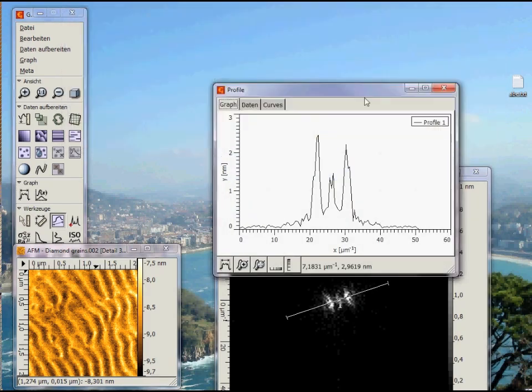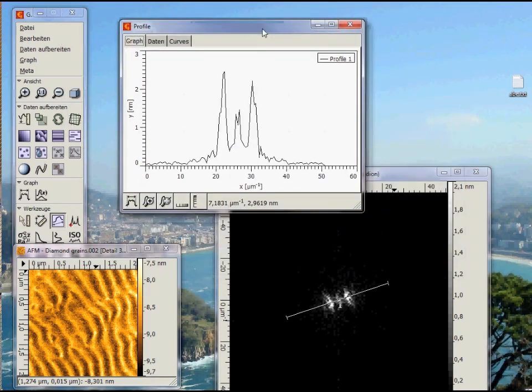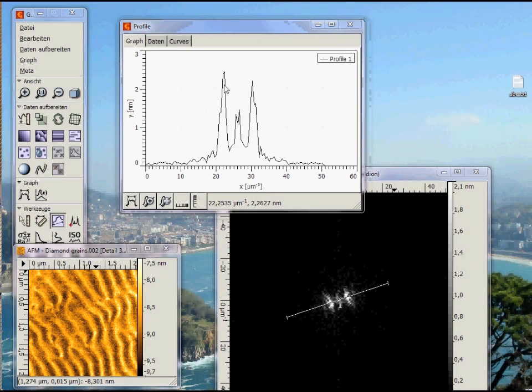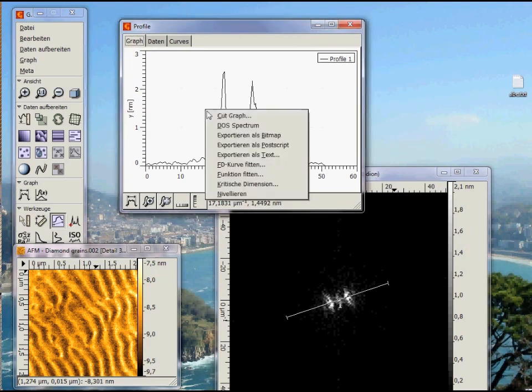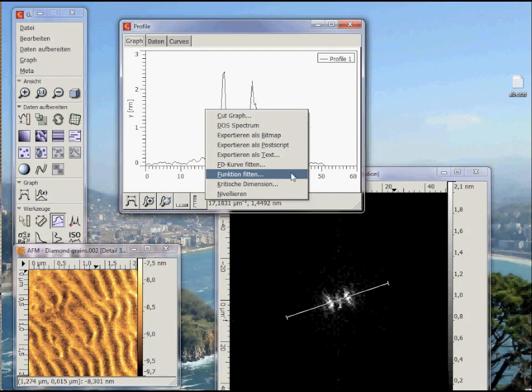The peaks in this profile exactly give us the frequencies of the separation of the waves seen in our AFM image. But the separations are given in the reciprocal space. So we need to find out their values and calculate the inverse. For that we fit some Lorentzians to obtain the exact peak positions.